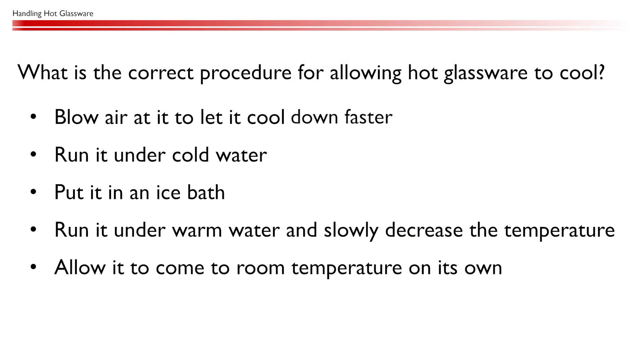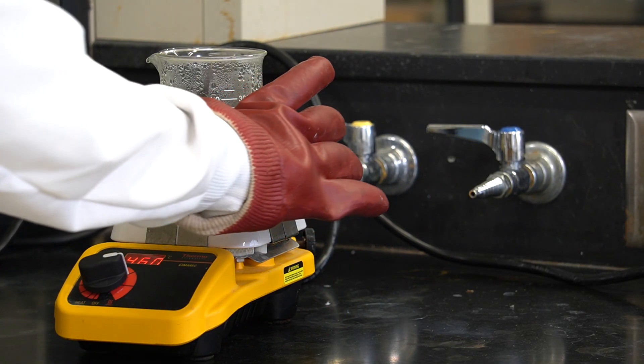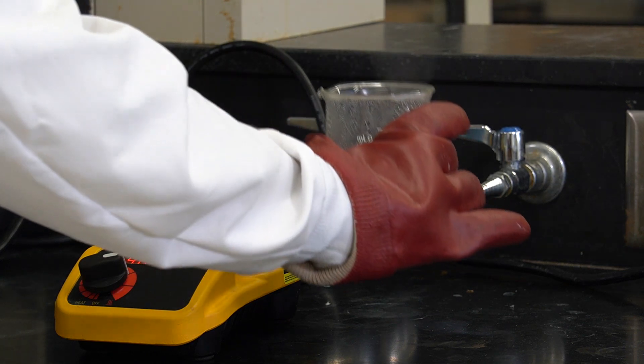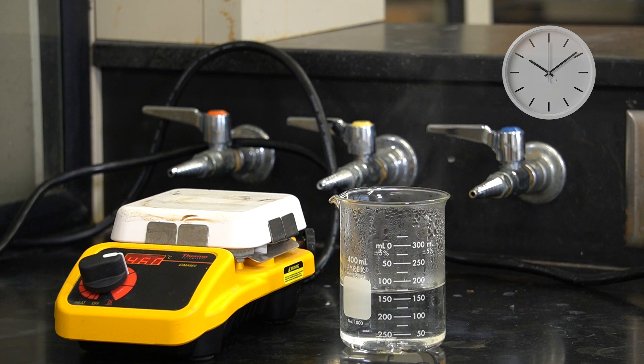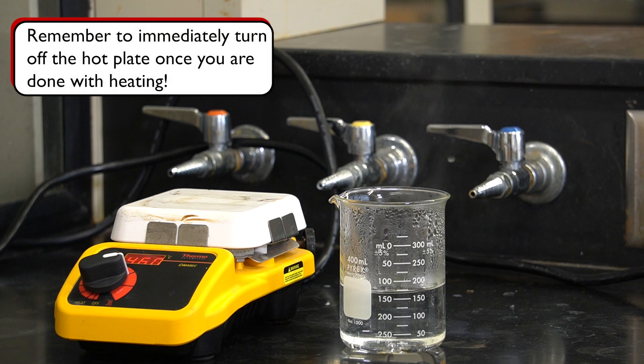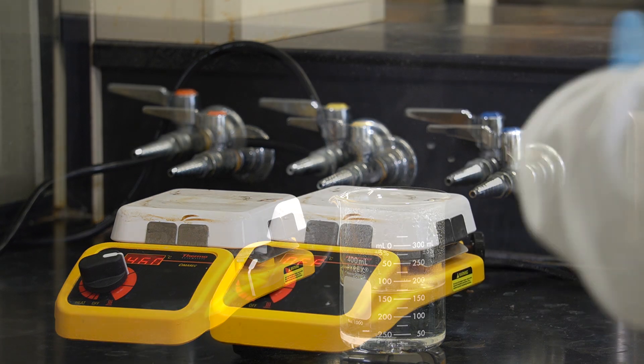To cool hot glassware quickly, you may be tempted to run it under cold water — unfortunately, that is a very bad idea. The thermal shock from the rapid temperature change can cause the glass to shatter, which is very dangerous. Always allow the glassware to slowly come to room temperature on its own, and do not touch it to check how the cooling is going, as it is very likely still very hot.